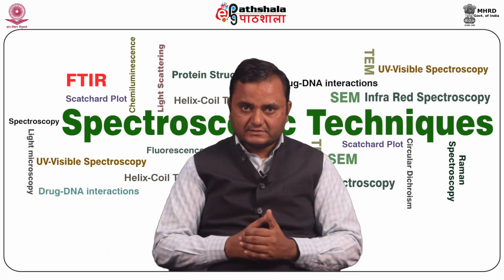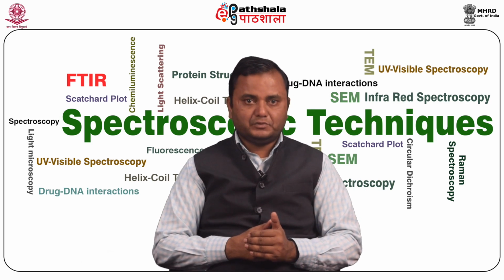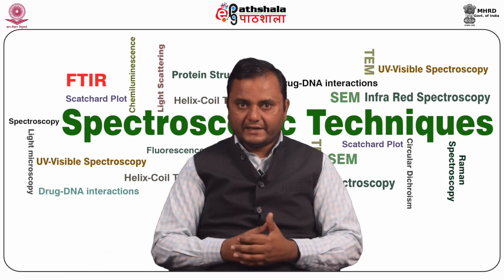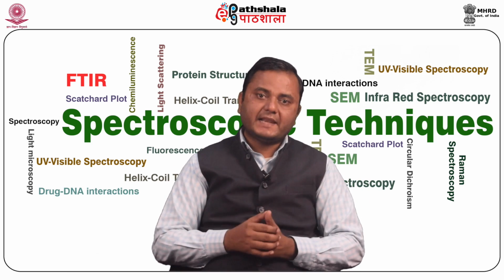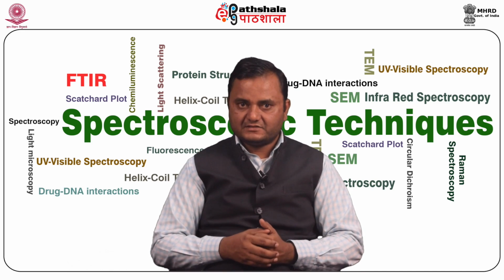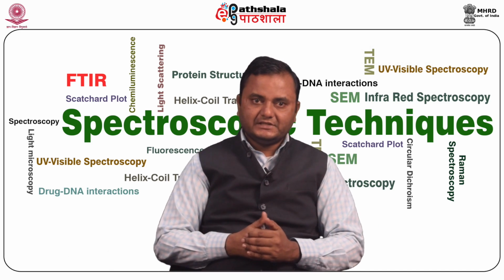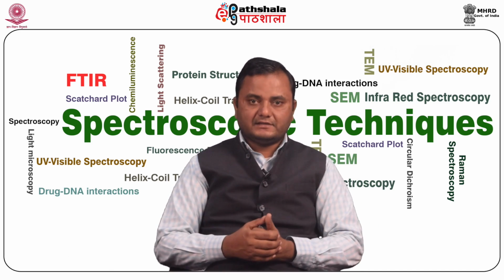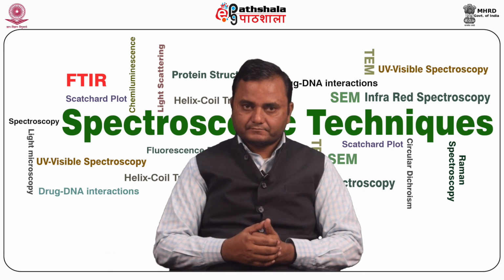FTIR allows only the interference signal to contribute to the spectrum. Background light effect is greatly lowered, and it allows selective handling of signal limiting interference. The sixth advantage is wave number range flexibility, and it is simple to alter the instrument wave number range in FTIR.